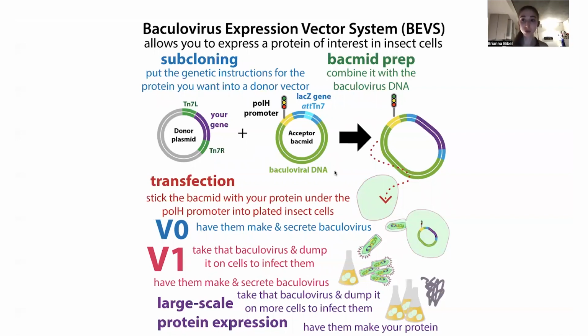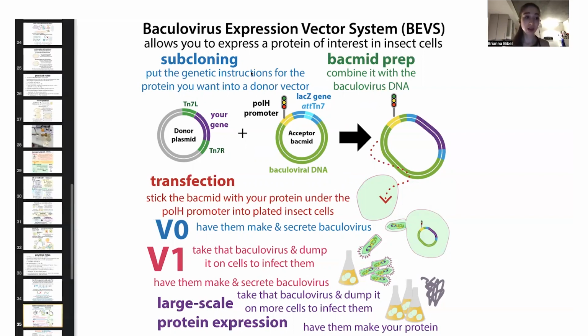It has these like multiple antibiotics and things that it needs, as well as a more complicated, it has to heal the plasmid that I put in after doing this like cloning procedure. And so it needs that time to heal, and it needs that extra time to heal. And so typically I do like at least 4 hours or overnight to actually allow it to do this.